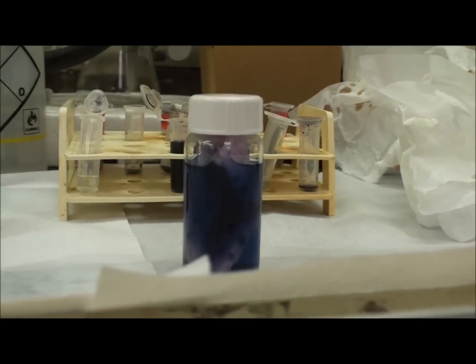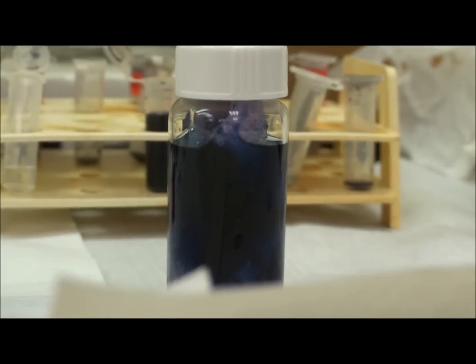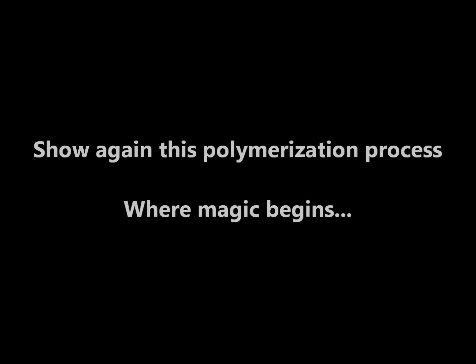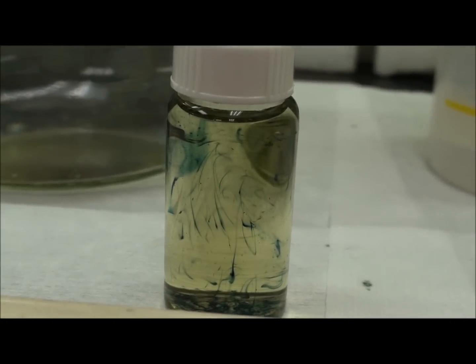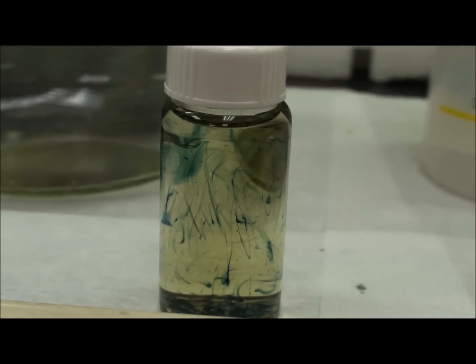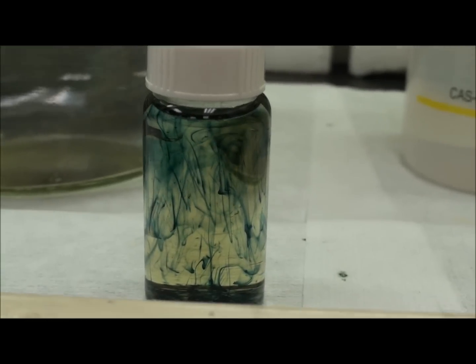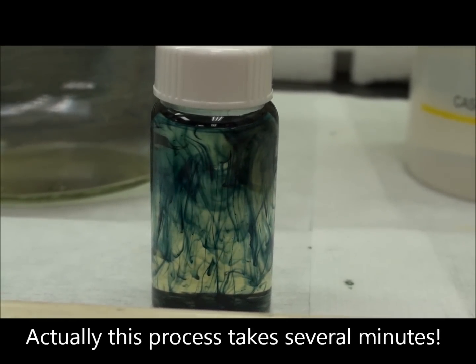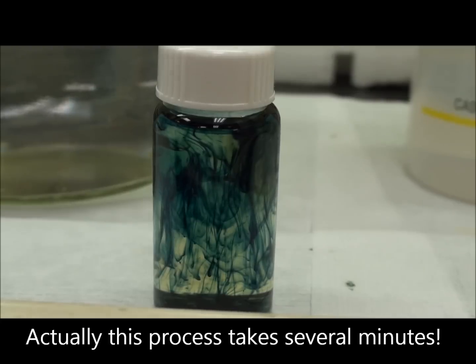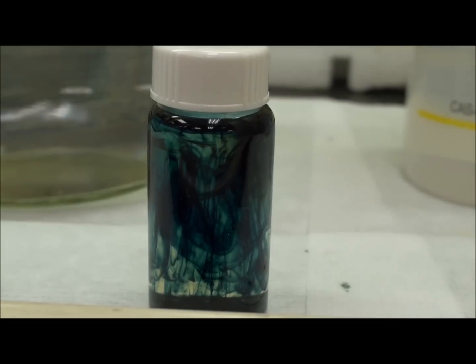Several minutes later, we show again this polymerization process — this is where the magic begins. At first there are some nucleation centers, then they twist together and become darker and darker. And this is really beautiful.